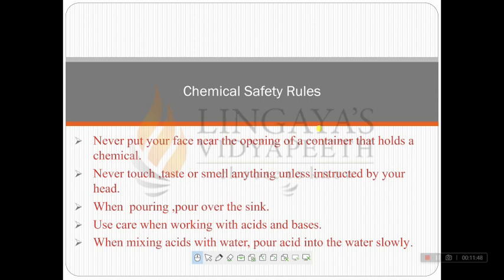A person should always bear in mind that a container should not be checked by keeping your face very close to it, because the chemical may be corrosive or carcinogenic. It may spill on your face or other body parts, or sometimes the gases that a chemical may hold are very poisonous. So you should never put your face near the opening of any kind of container.